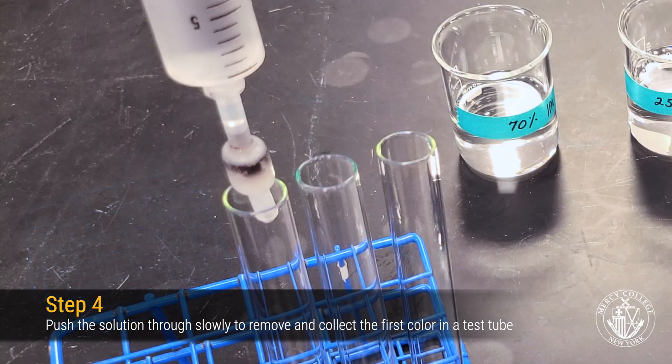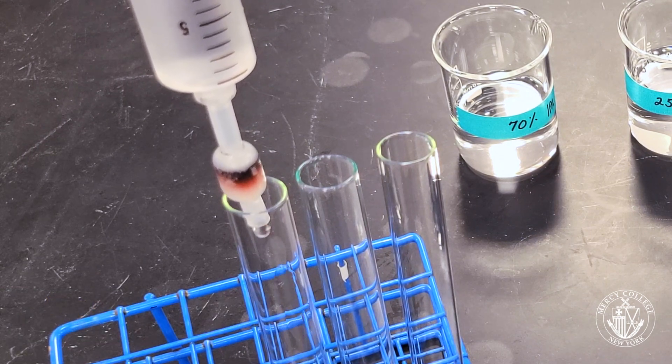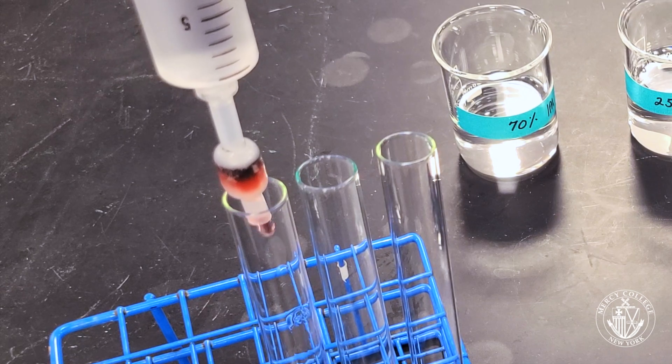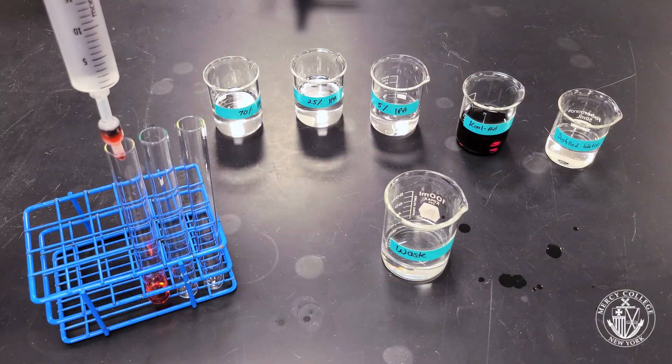Now position the syringe above your first test tube and begin to push through the 5% IPA solution. You should see that the 5% IPA solution begins to remove the red color from the chromatography column while leaving the blue color behind.